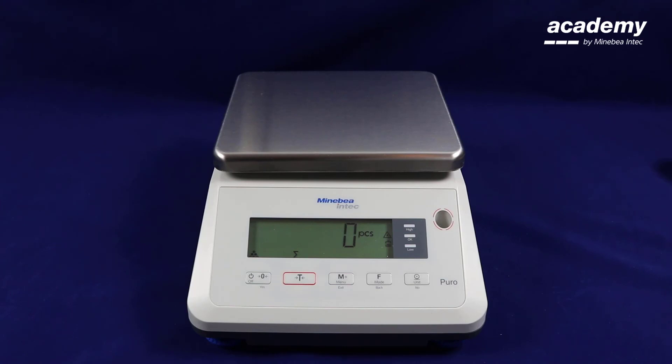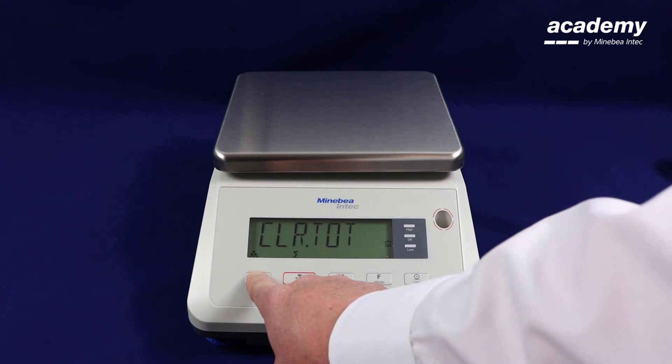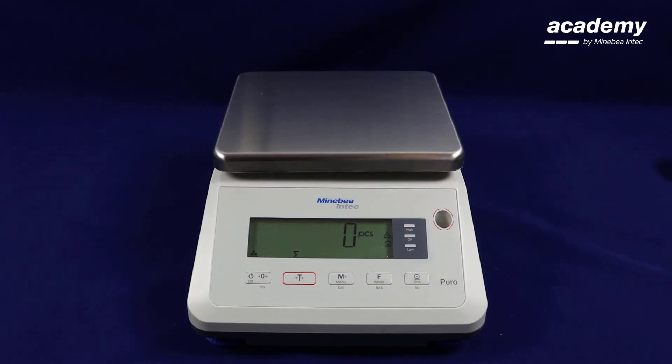To clear these results from the memory, press and hold the tear key until clear total appears on the screen. Press yes to confirm. Now when you press and hold the M plus key, no information is stored in the results.